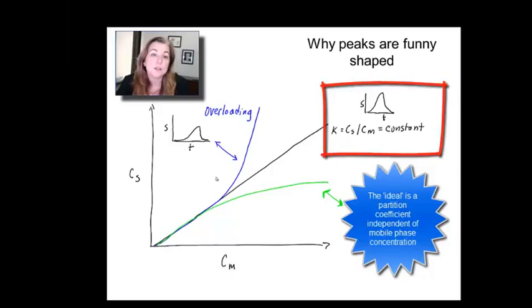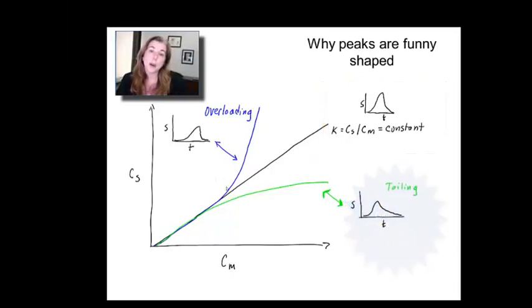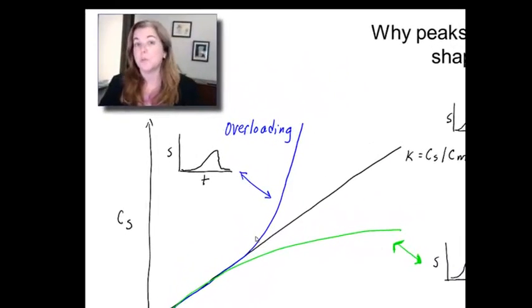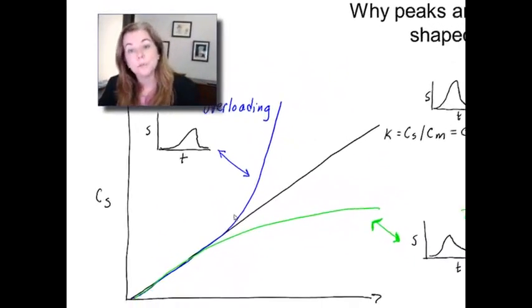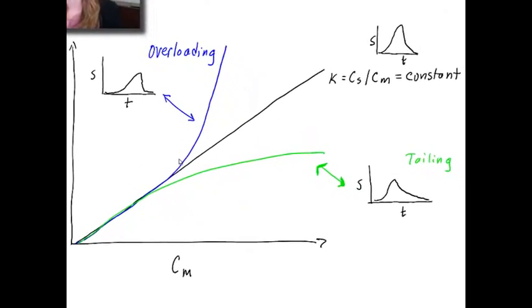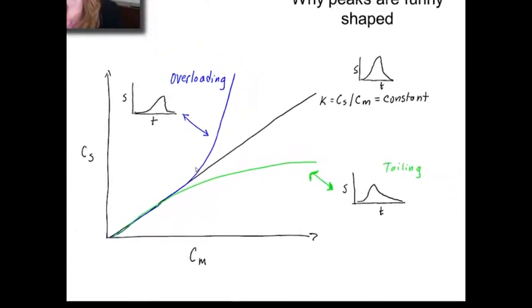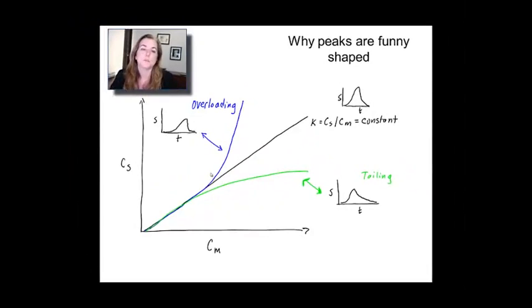But that's not the case. So, one possibility is you can get overloading, in which you actually get a higher concentration in the stationary phase than one would expect. Or, conversely, you can get tailing, where you have a lower concentration in the stationary phase than you would expect. Both of those lead to funny shapes.